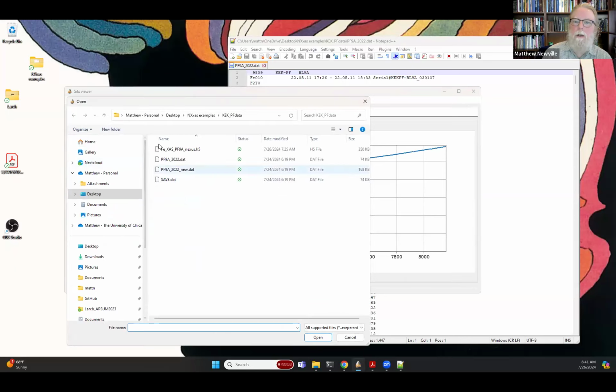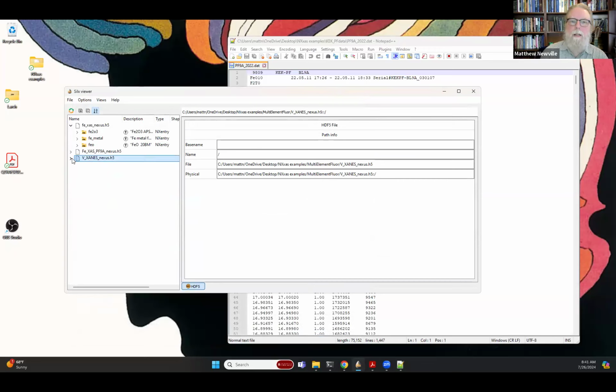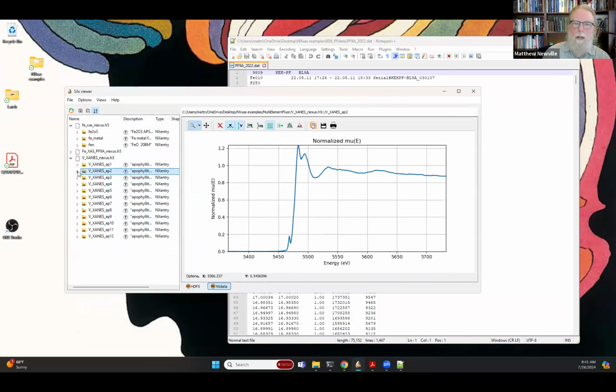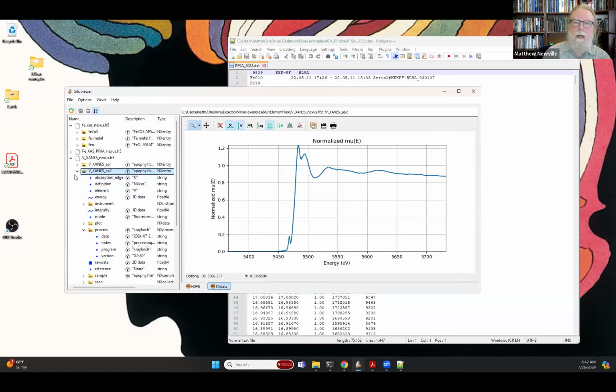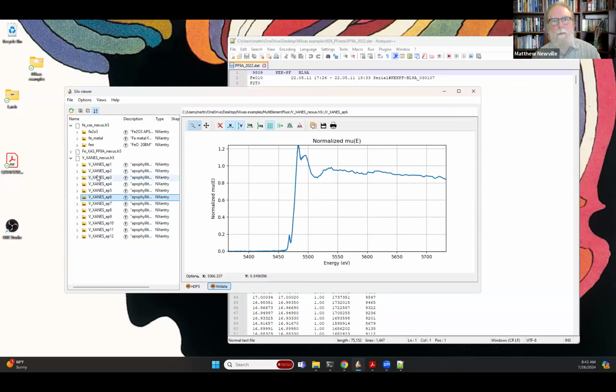And then one last example. I don't want to belabor this. Here's multi-element fluorescence data and a bunch of spectra that were collected for vanadium XANES, I don't know, 12 samples or something. This is multi-channel XAS, with multiple columns and a dead time correction done during the processing to get to this plot for this data set. Some of the data here are kind of noisy and there's a little bit of variation, but you can quickly browse through that.